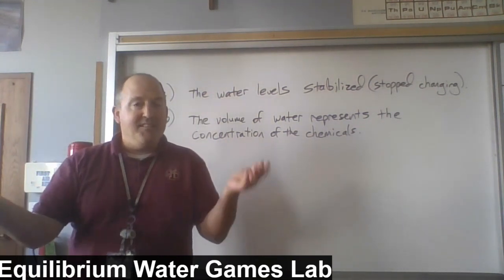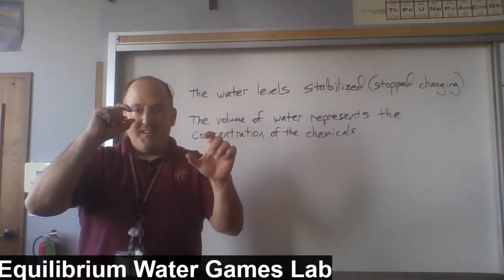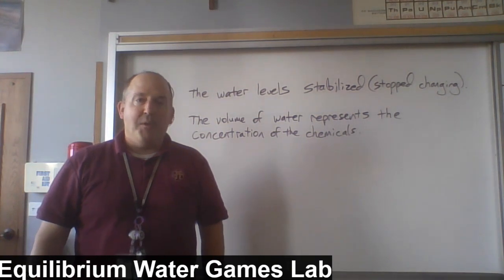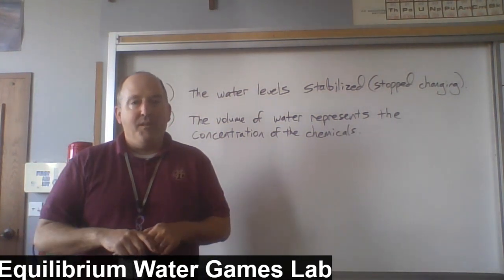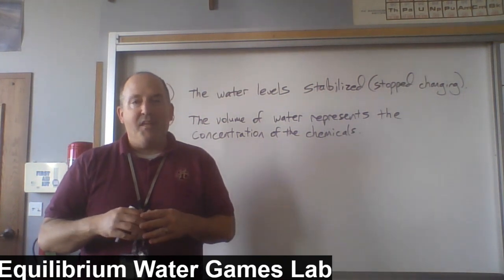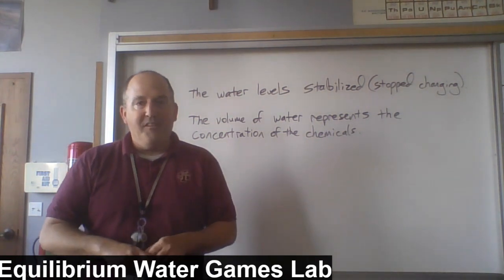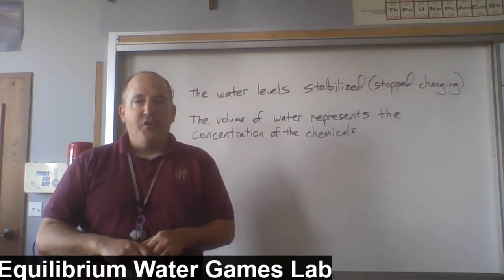Isn't that interesting? Isn't that curious about using a 50 milliliter size transfer beaker and a teeny tiny 10 milliliter size transfer beaker? I invite you to think about what that implies about chemical reactions. And as we study more in equilibrium, I think the answer to that question will get more and more nuanced and more full as we go along. Thanks for your good work in this lab.